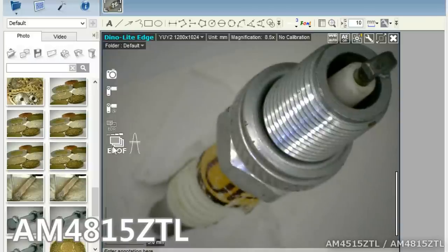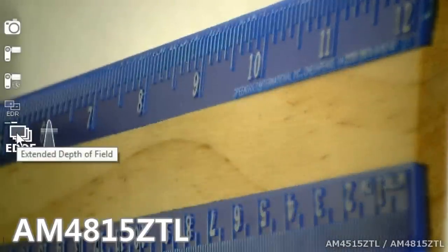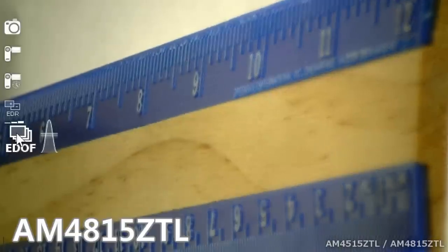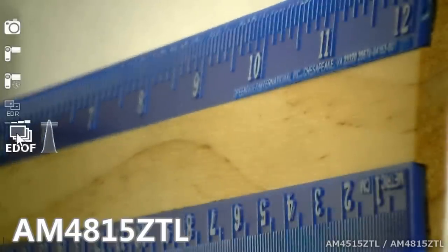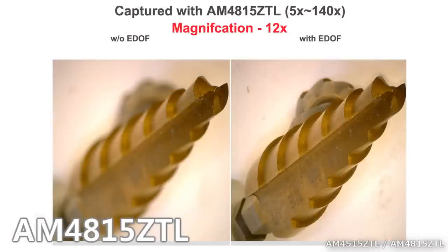The AM4815ZTL has EDOF, or Extended Depth of Field. This allows users to capture multiple images, and the DynoCapture software stacks these images into one clear image. The AM4815ZTL also has a useful refocus feature that can adjust focus at different depths.